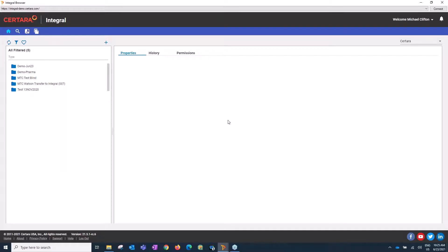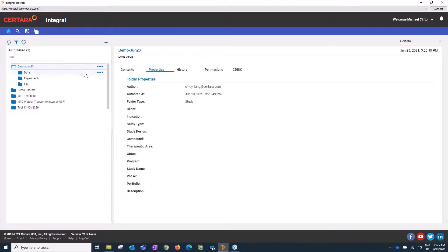After logging in, you can see that because Cindy added my permissions, I only have access to certain folders. Here's the folder that Cindy just created. Say the PK scientist received final concentration-time data from their lab and needs to use that data for analysis. First, I'm going to upload it to Integral.